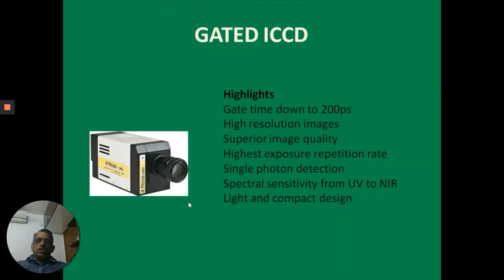So this really gives you a lot of information about the nature of the light sources being used in spectroscopy measurements like absorption spectroscopy, fluorescence spectroscopy, and time resolved fluorescence and photochemical instrumentation. Detectors also we have taken care of so that they can be used in photophysical and photochemical experimentation.